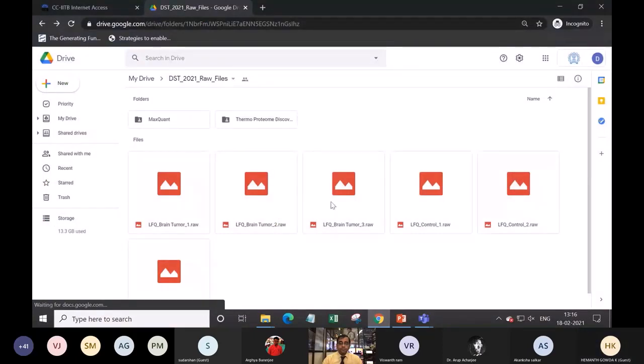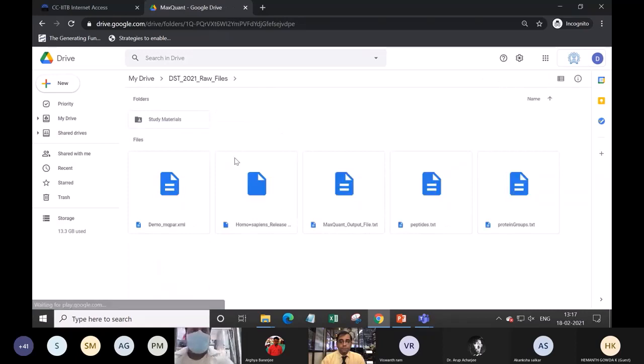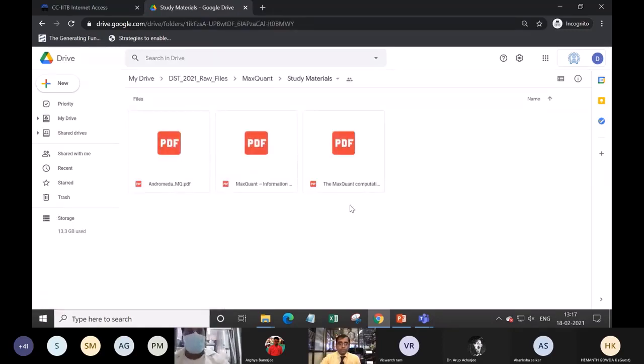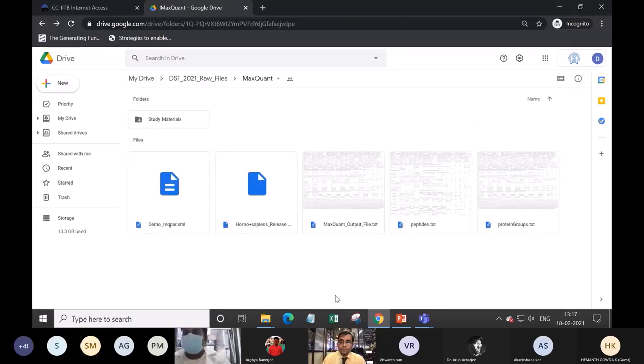Okay, thank you, sir. So I will first show the Google Drive link that has been shared with the participants. And I will request all of you, as Professor Sanjeeva has already mentioned, that you have to download these raw files. But in addition to these raw files, please download at least the demo MaxQuant parameter file and the Homo sapiens database. And there are a couple of study materials I have made available that you can also download, which will be helpful during the steps that we will show using MaxQuant.